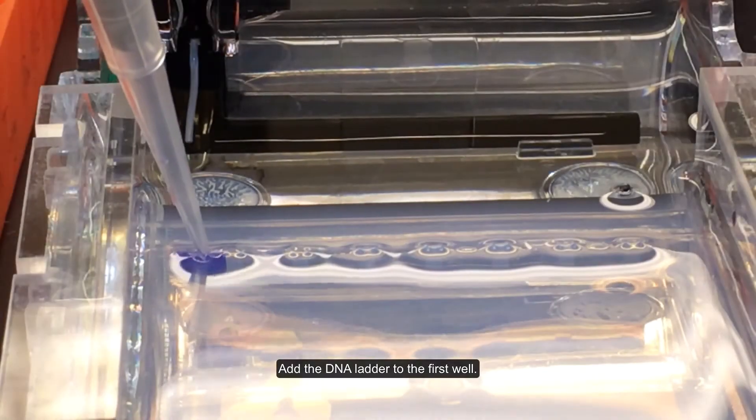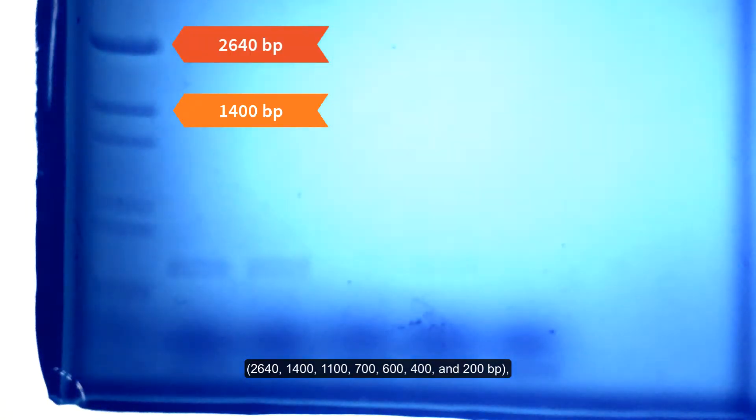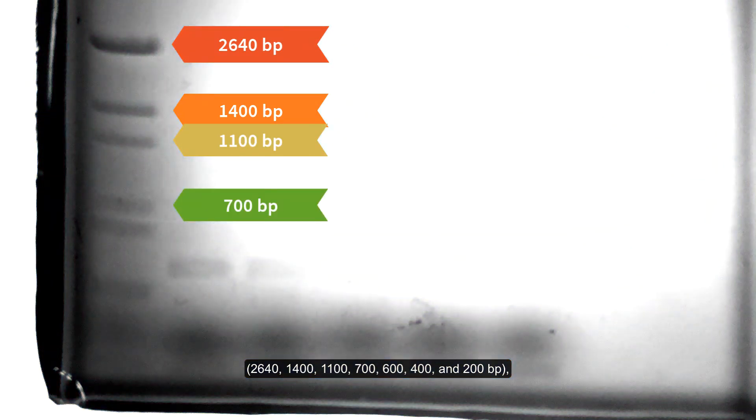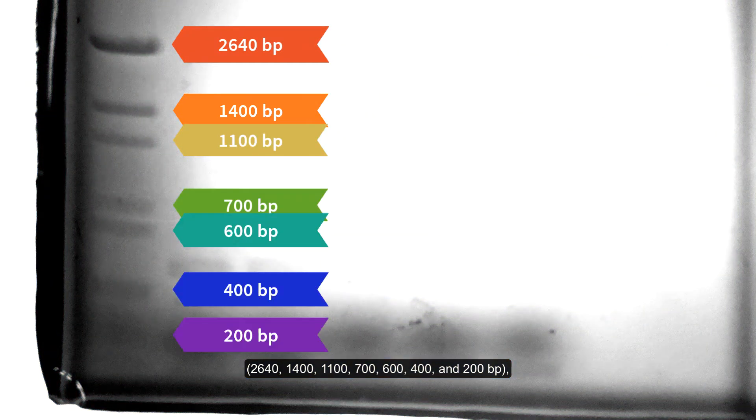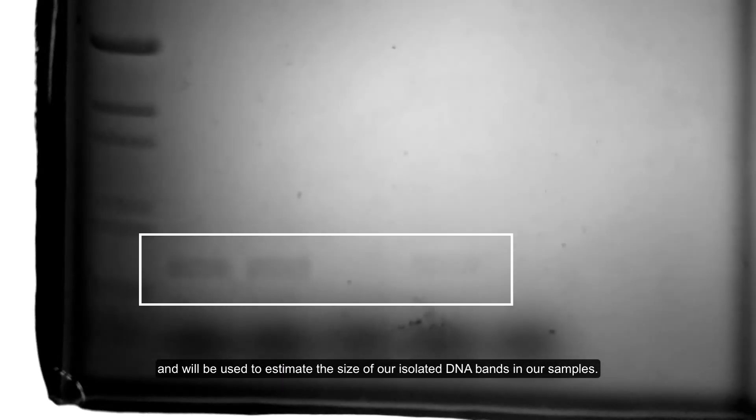Add the DNA ladder to the first well. This ladder contains DNA fragments of known lengths 2640, 1400, 1100, 700, 600, 400, and 200 base pairs, and will be used to estimate the sizes of our isolated DNA bands in our samples.